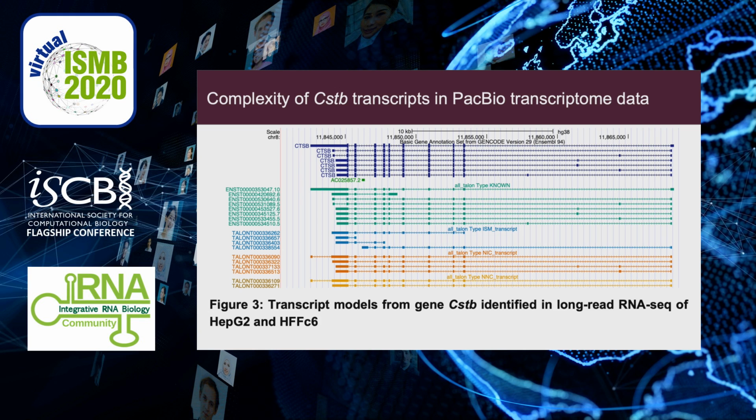Here are some transcripts that TALON calls from the data, shown on the genome browser, that belong to the gene CSTB. As you can see, in this visualization, it's difficult to tell what the difference is between any two transcript models. Knowing that these visualizations lack in informative ability motivated me to develop this software.